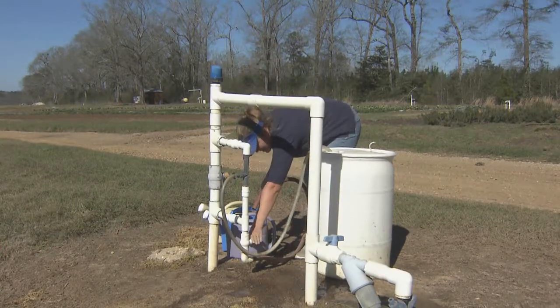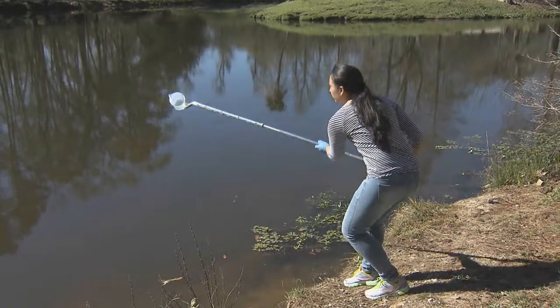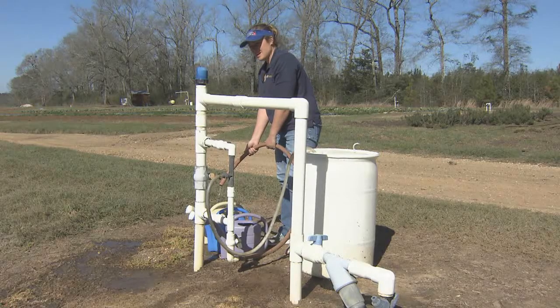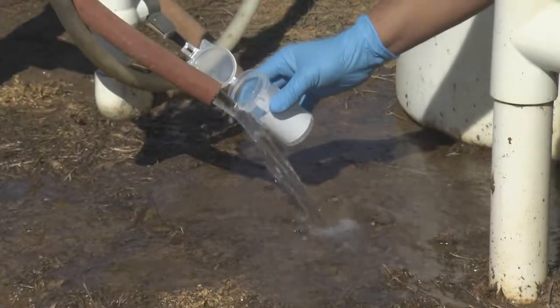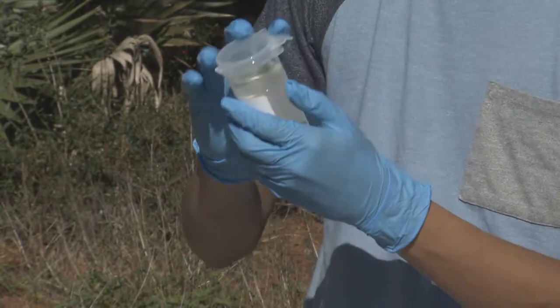The frequency and number of samples varies depending on the source of the water, with a higher number of samples required for surface water sources such as ponds, canals, and rivers, and fewer samples from well water. Proper sampling and handling techniques in transportation are required to accurately determine the water quality.